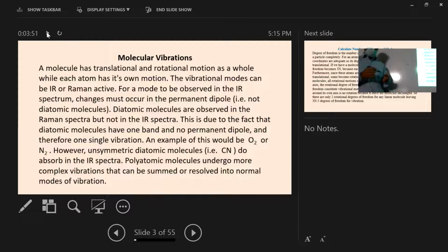So a linear molecule is just like a rod, with atoms at the two different ends of a rod. In that case, we can consider this a linear molecule, and if the shape is not in a line, then we can consider this a non-linear molecule. If you know the structure type of a molecule, then you can calculate the number of vibrations.